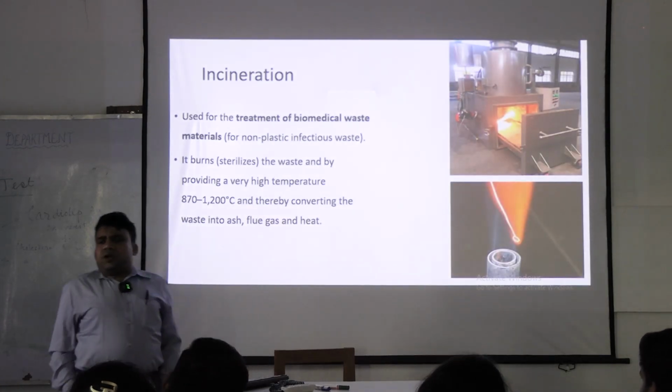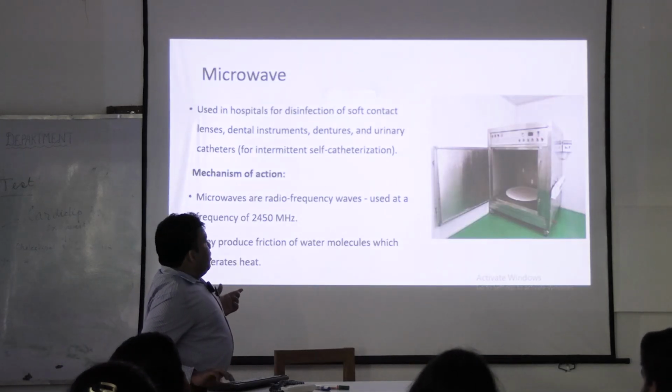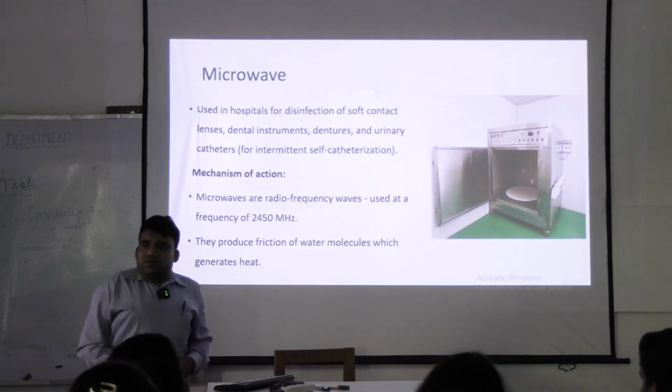Incineration, I don't think I need to elaborate on that. Incinerator basically means burning all the things that are there. And finally is microwave. What is the microwave?